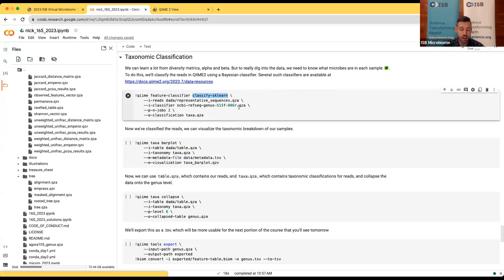Let's look at how we can use QIIME to classify the taxonomy of our ASVs. The first thing we'll do is use a plugin in QIIME called feature-classifier. As you might guess, this will take our ASVs and apply the multinomial naive Bayes method we just discussed to assign them taxonomy. Specifically we'll be using the classify-sklearn action within that plugin. As inputs we'll use our representative sequences — our list of ASVs as identified by DADA2 — along with a classifier containing all the k-mer profiles for several reference taxa.